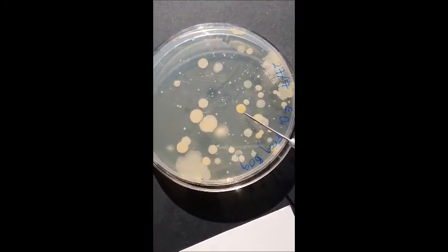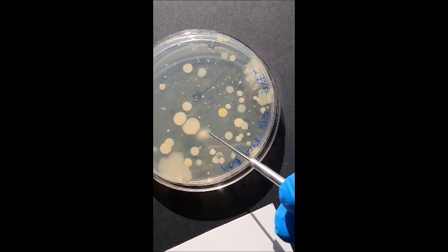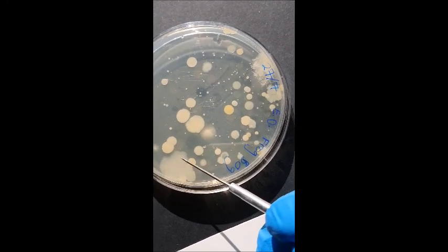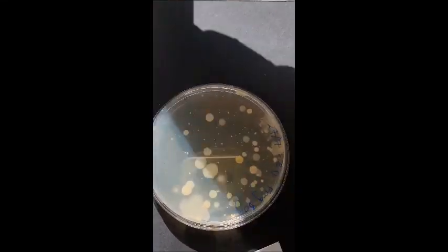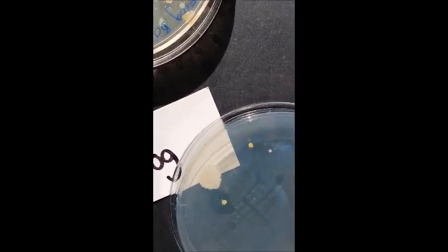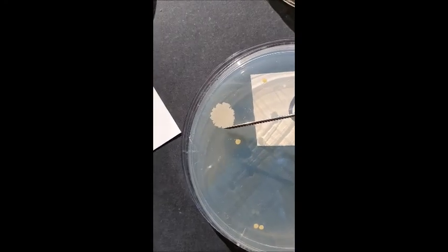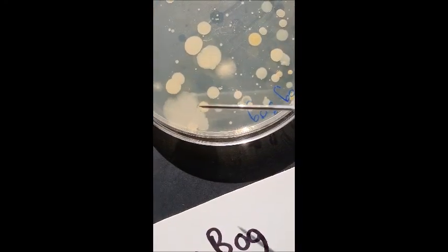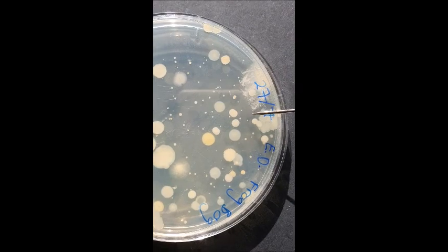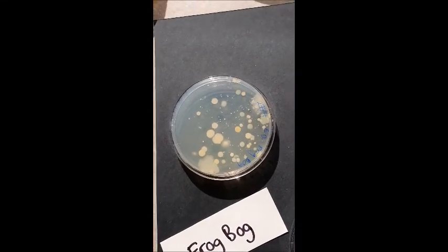Like there's that yellow one that we've seen pop up. This white one looks kind of different to this creamy colored. Then there's this guy, which looks like a fungus because it's all fibrous-y. This blobby one actually looks similar to that keyboard. Yeah, look. Oh no, actually, when you really look at it, the edge of this is a lot more convoluted than the edge of this. Oh, they're kind of similar. They could be the same. Similar. Yeah, fibrous, but there's so many different types in here. That's the frog bog. Obviously, that's not getting sterilized, but these are good bacteria, right?